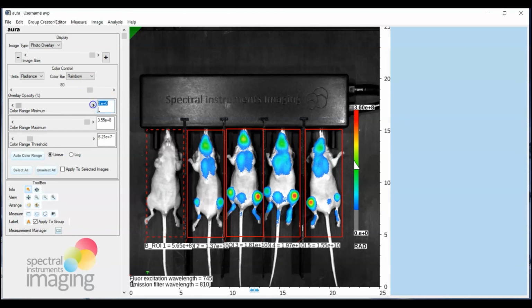And you can do that by simply typing it in. And what you'll get now is the threshold value of data presented as the minimum of your calibration bar, and you also already have the maximum in the calibration bar, capturing the entire dynamic range of the image presented in your AMI file.